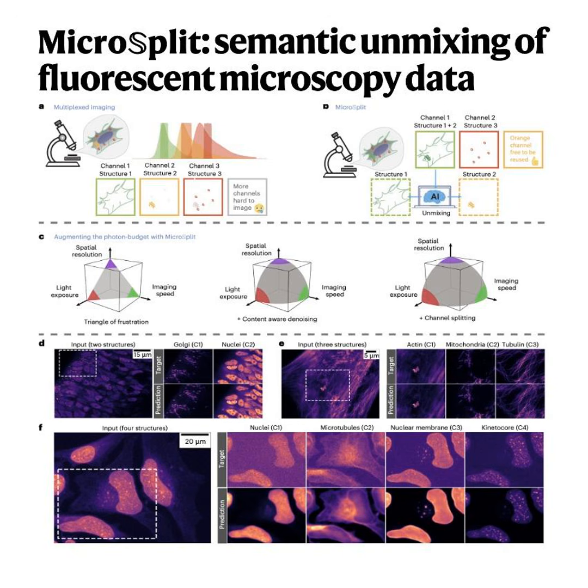Like if a chatbot hallucinates a historical fact, it's annoying. But if a bioimaging AI hallucinates a structural anomaly that isn't really there, that's catastrophic for the downstream science. The authors were acutely aware of this, which is why MicroSplit is built on a variational architecture. Meaning it has a built-in, I don't know, mechanism. Exactly. It explicitly quantifies its own uncertainty. This is honestly my favorite part of the paper. How does it calculate doubt?